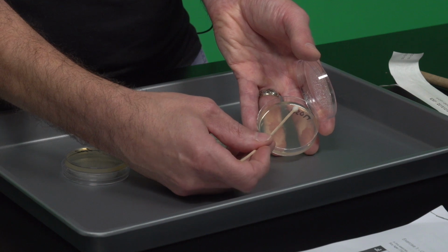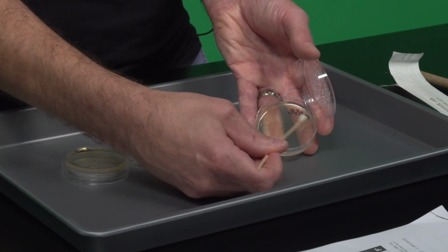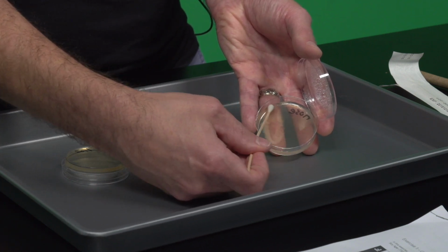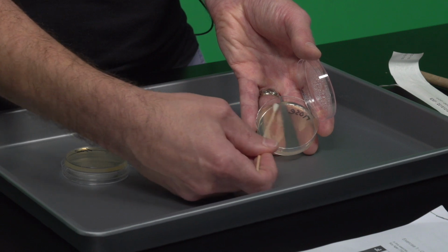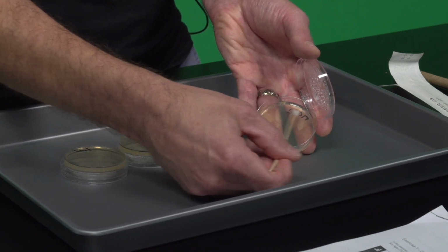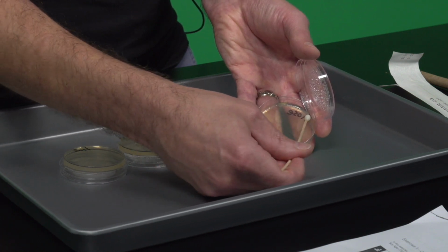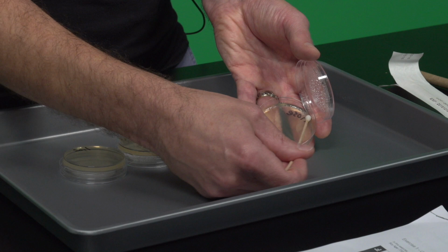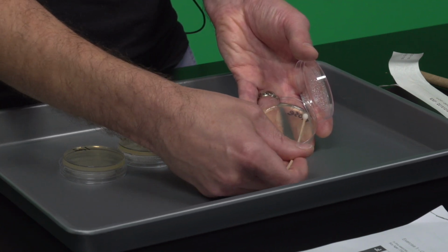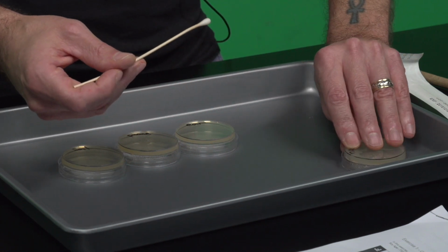And I'm going to go ahead and turn the swab over 180 degrees so that I'm making sure that whatever microbes I got on the swab come off. And the problem with this is that there's still going to be a lot of microbes on the swab because the swab has high surface area, microbes are going to stick to it. And so what we're trying to do is make those bacteria go off of there. Okay, so that's what we've got there. And so once you've got that squared away, go ahead and close this up. Put it upside down out of the way.